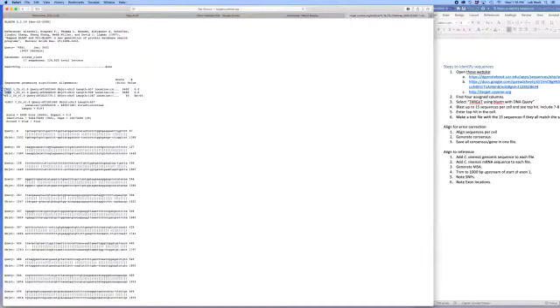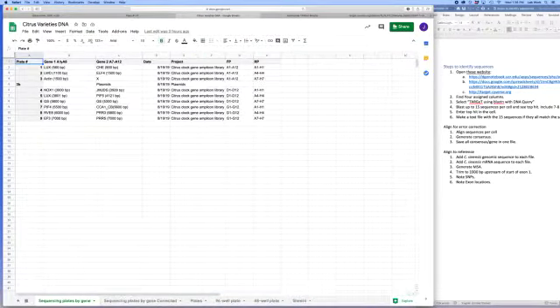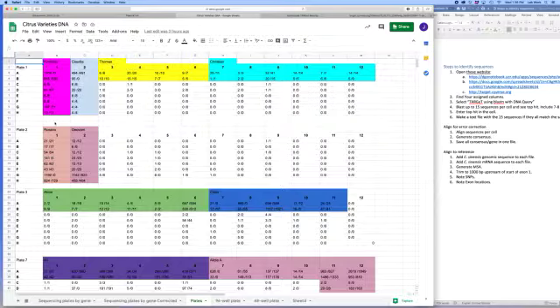The same protein does the same function in citrus as two proteins do in Arabidopsis. But we'll go with that. So now we know that this is not A1. It's not Lux. We know now that it is, in fact, CCA1. So what you're going to do is go in here and say CCA1 slash LHY1.